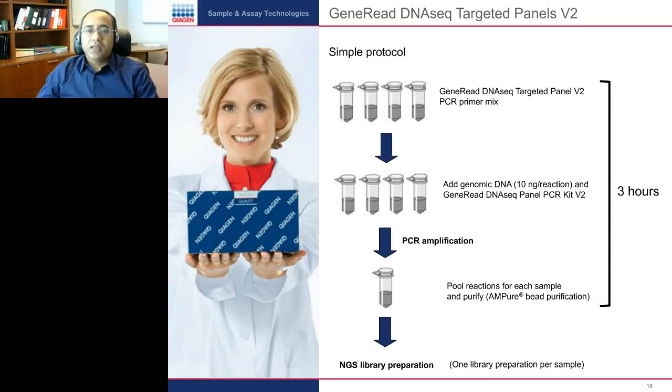You add the genomic DNA and the master mix into a targeted panel PCR primer mix, which we will provide you, and then run the PCR.